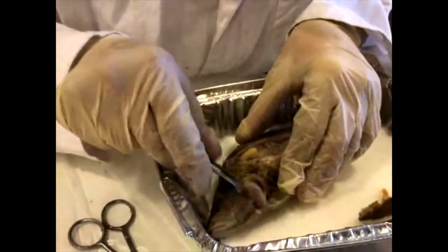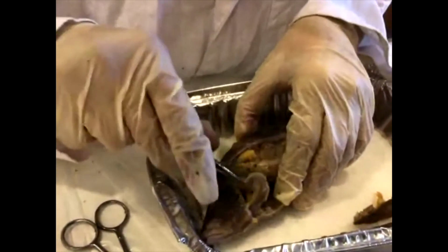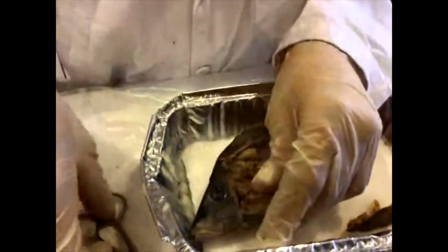Okay, so we're going to remove these gills again. Maybe with some scissors.